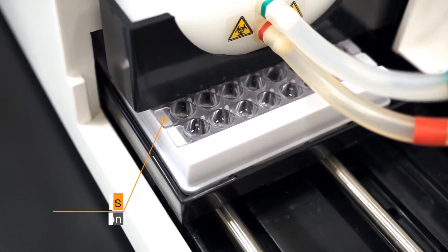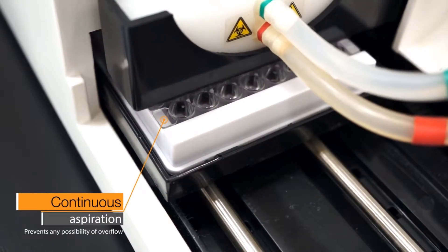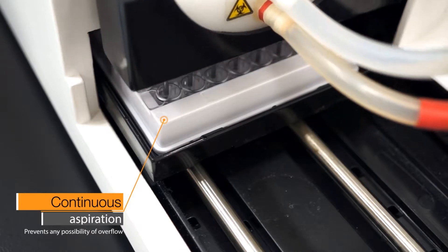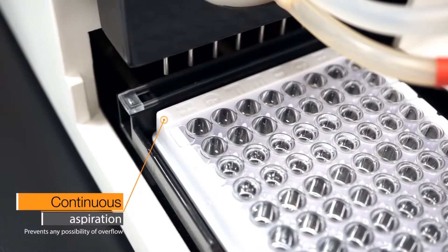Continuous aspiration prevents any possibility of overflow, while a specially designed manifold prevents the needle from colliding with and scratching the bottom of the wells. This ensures that the coated analytes stay undisturbed in the bottom of the wells and allows for dependable and accurate results.